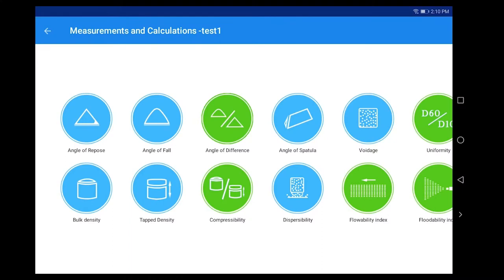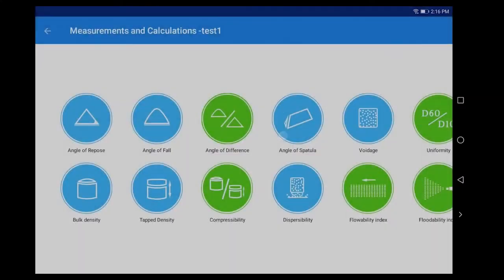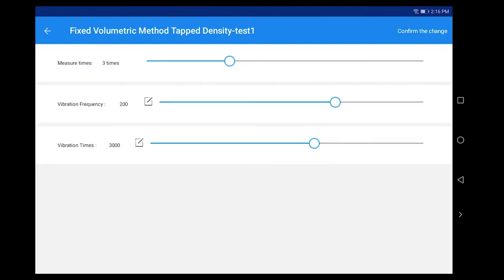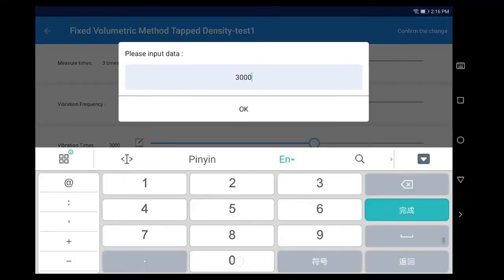Click Tap Density. Click Fixed Volumetric Method. Click Options. Set Measure Times, Vibration Frequency, Vibration Times as required.